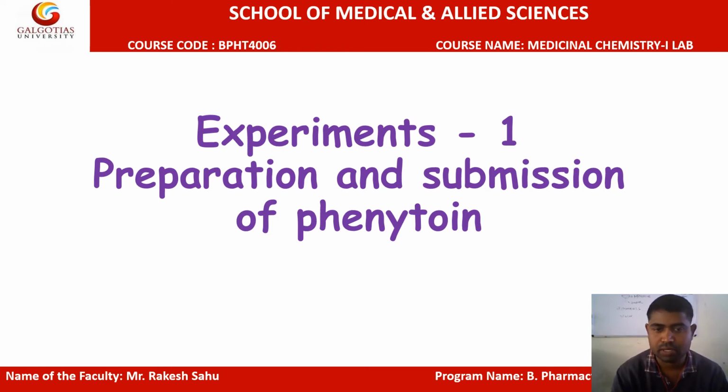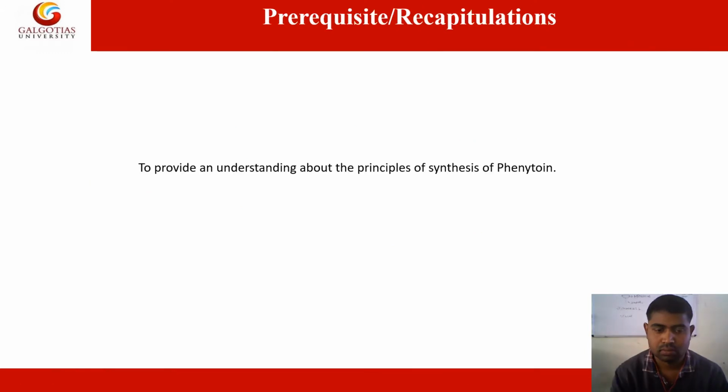My today's presentation topic is experiment one, that is preparation and submission of Phenytoin. So let's start it. The prerequisite of this presentation is to provide an understanding about the principle of synthesis of Phenytoin. So now let's move to the next slide.